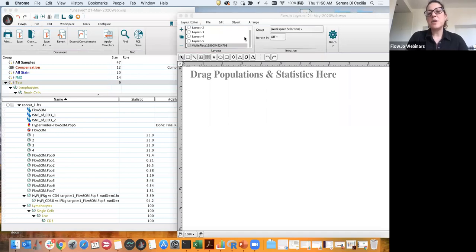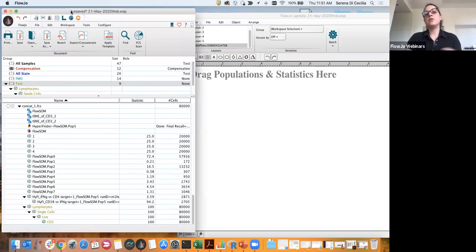The purpose of Sunburst, it's a Shiny app. So it's basically to create a graph for you, because usually this kind of software, or at least FlowJo, was not creating graphs before or Shiny apps before. I can absolutely show you how to concatenate again.